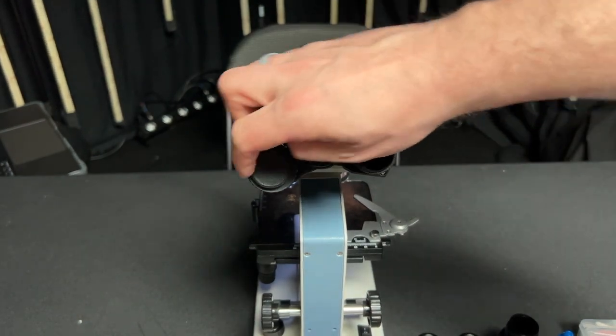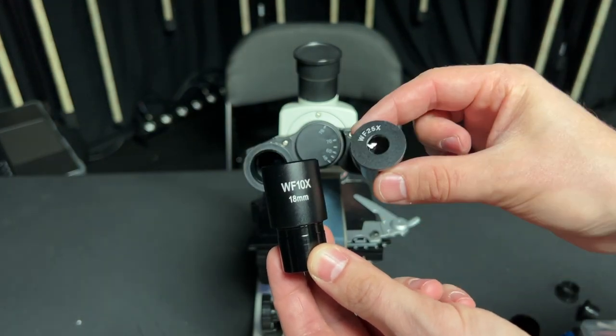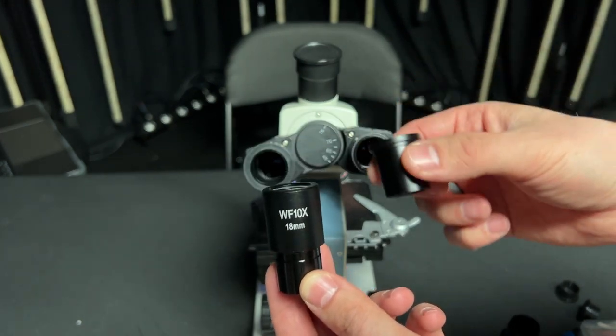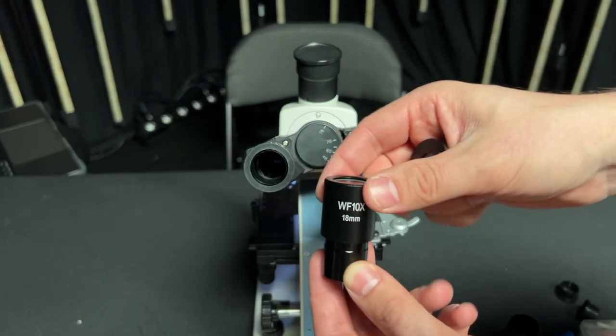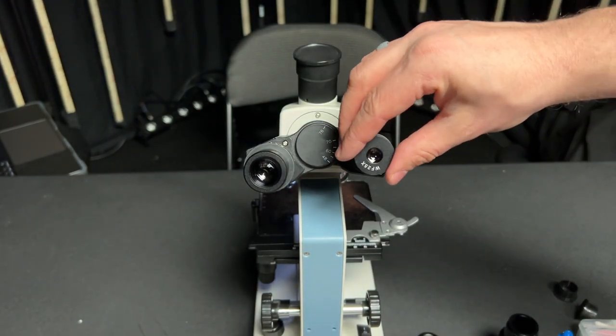Now you can remove the lens caps by pulling them out like so and then it's up to you but you can insert the different size lenses into the eyepieces as well. You won't be able to use the microscope without picking these eyepieces to put in there so do be aware of that. So go ahead and you can see we can slot that one in like so. We can slot this one in as well.